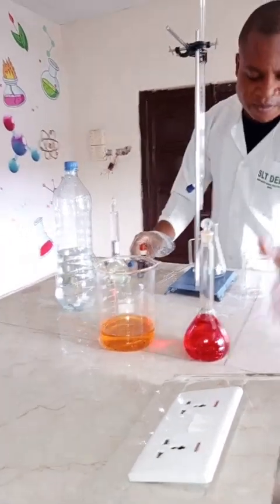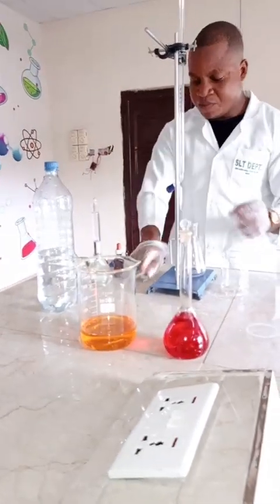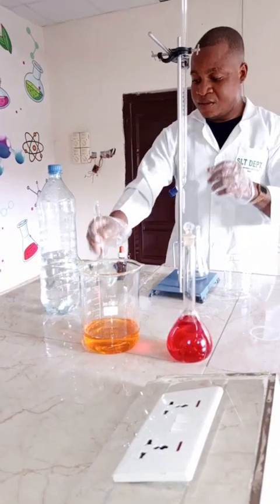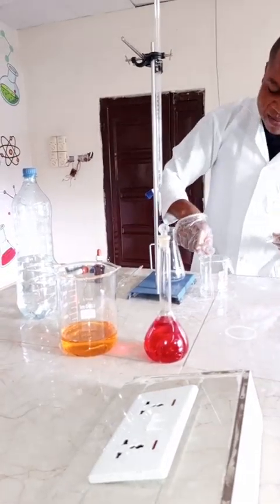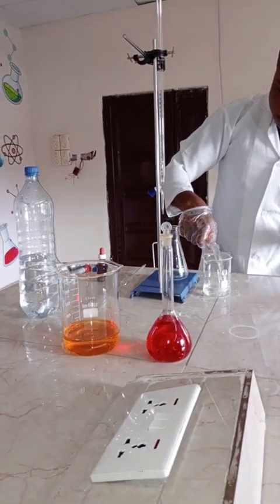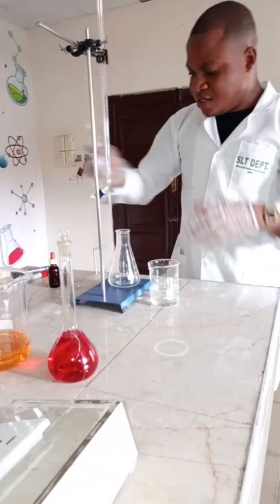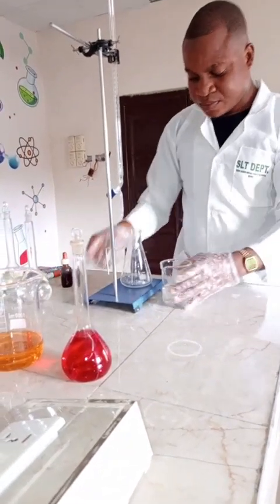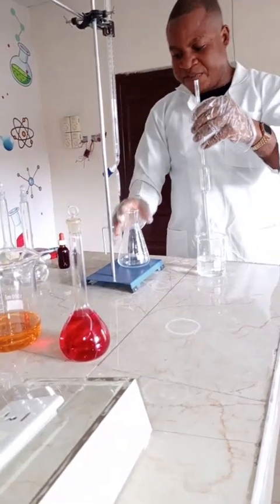This is my stock solution from that. Now, this is my base. I'm going to prepare 25 ml of the base. Enable me to turn it into my beaker for easy pipetting. I'll pipette it, the base.